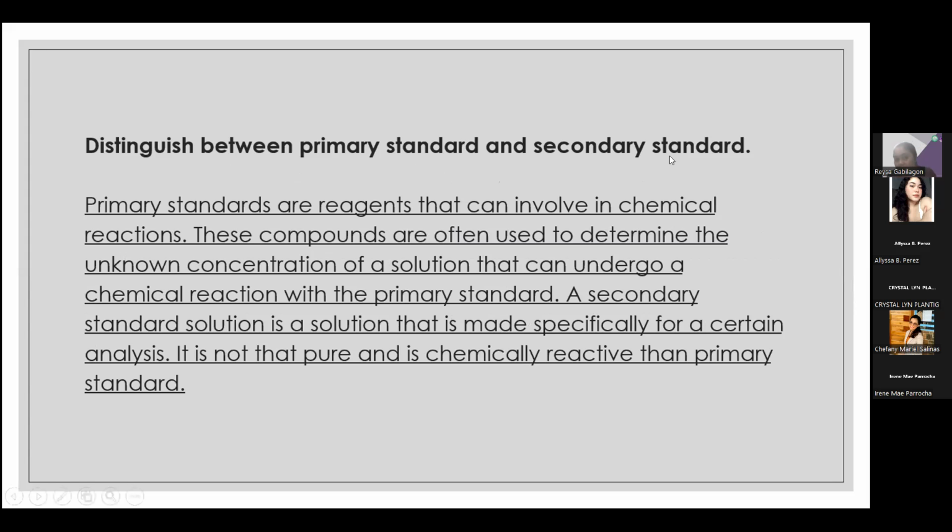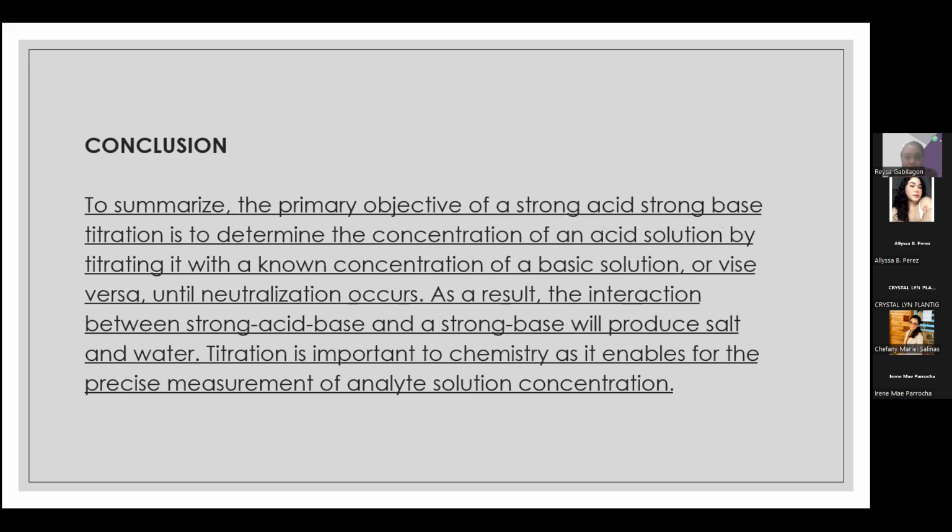Primary standard and secondary standard. Primary standard is solid, very pure material used during titration. While the secondary standard is a solution, so it is a liquid. Okay? When it comes to purity, yung strict tayo, primary standard talaga. Kailangan muna 99.9% pure siya. Kaya medyo konti lang yung primary standard natin.